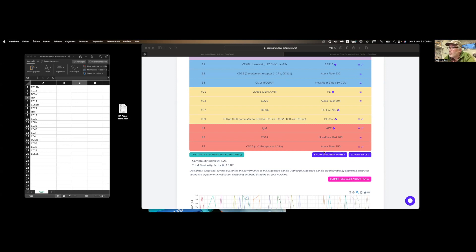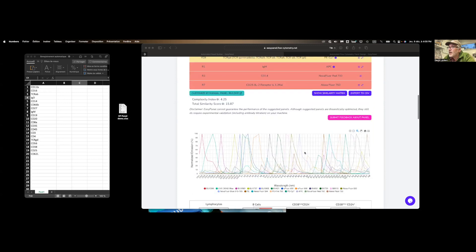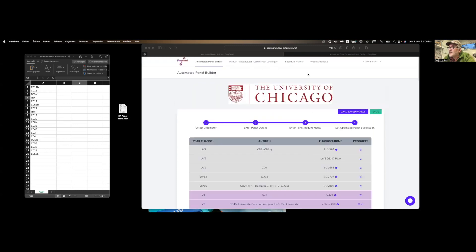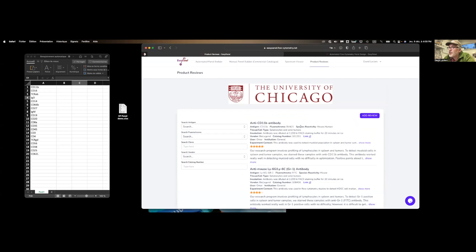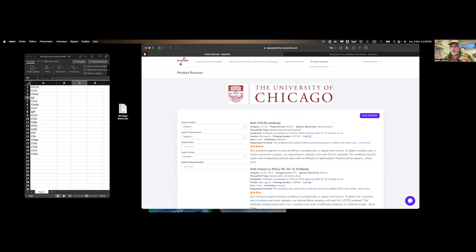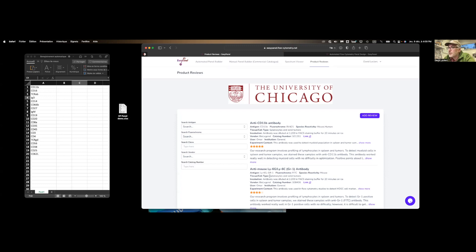Lastly, there's a product review link at the top. So you'll be able to enter your own reviews of the antibodies that you used. And so over time, as that library of reviews gets bigger and bigger, it becomes more and more useful to the users of this particular EasyPanel tool.